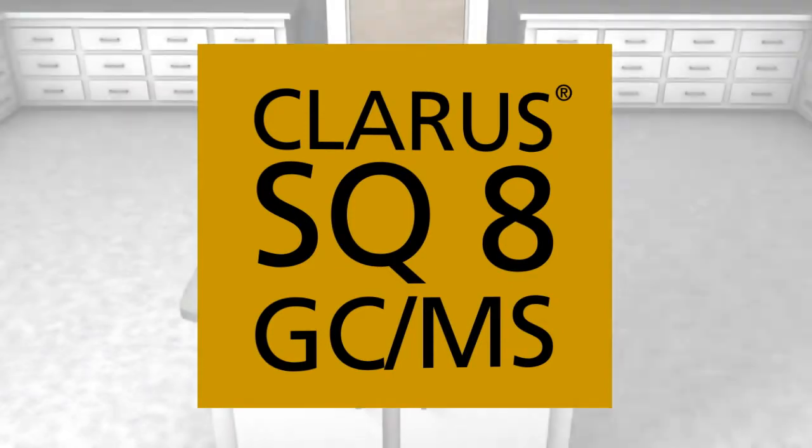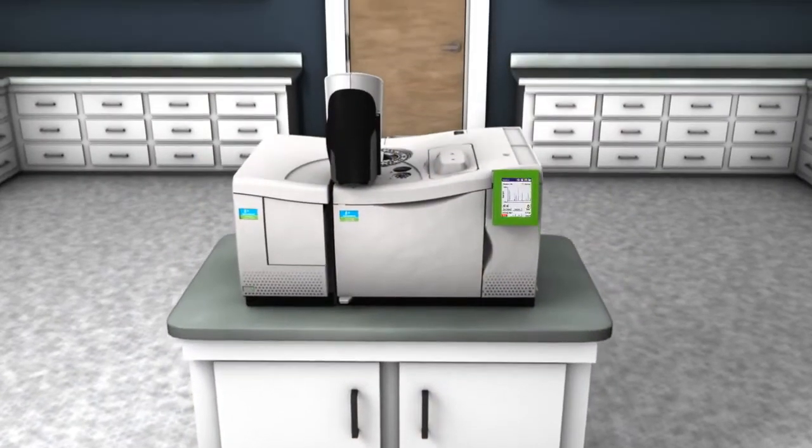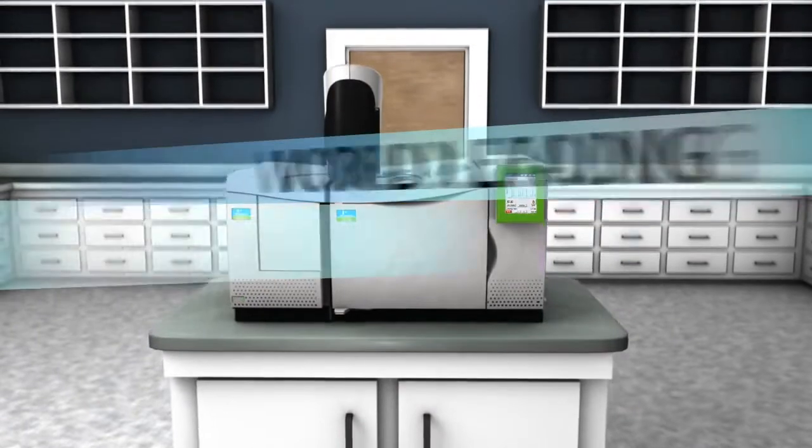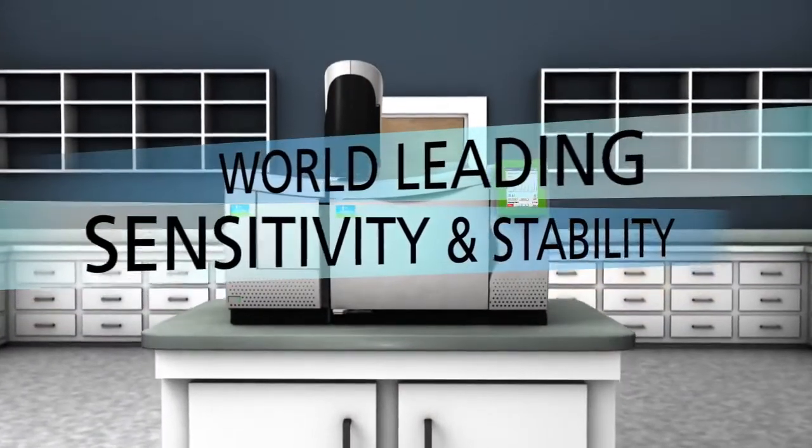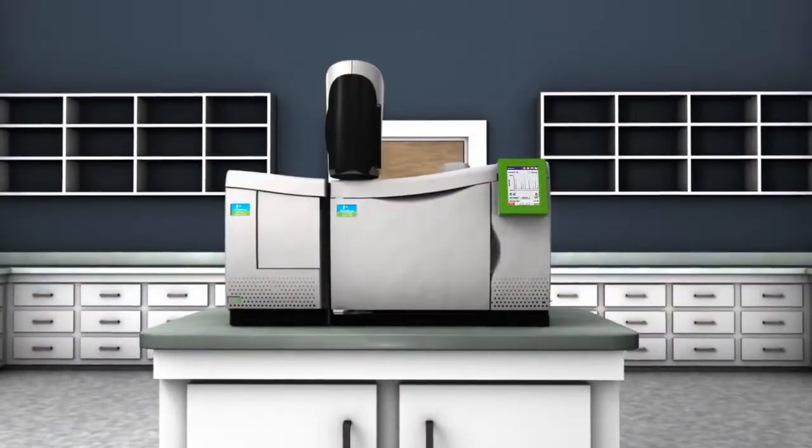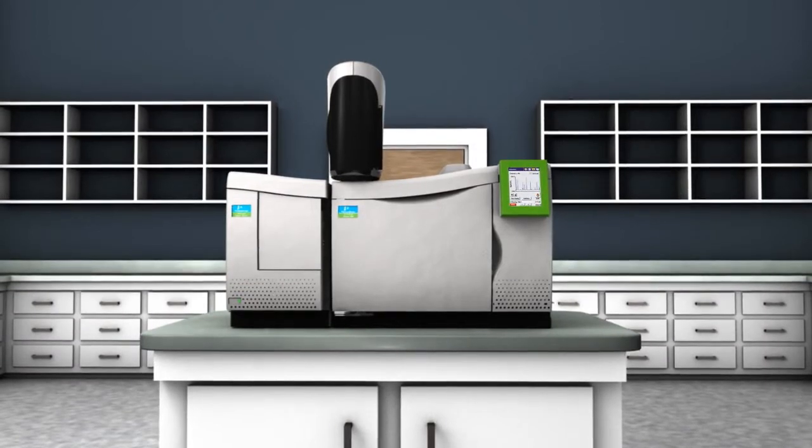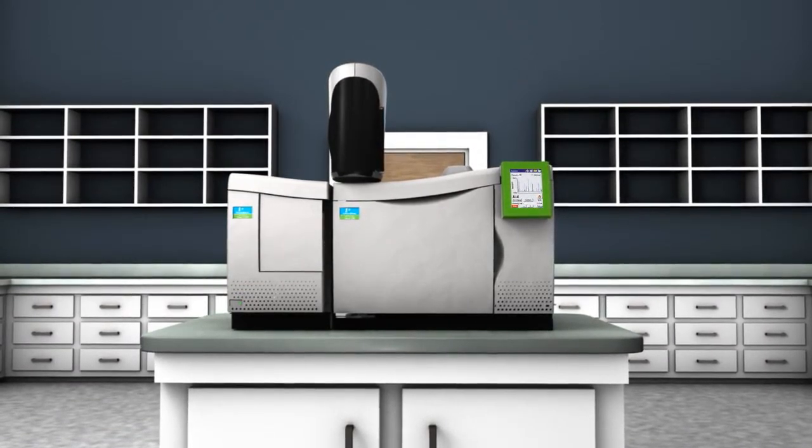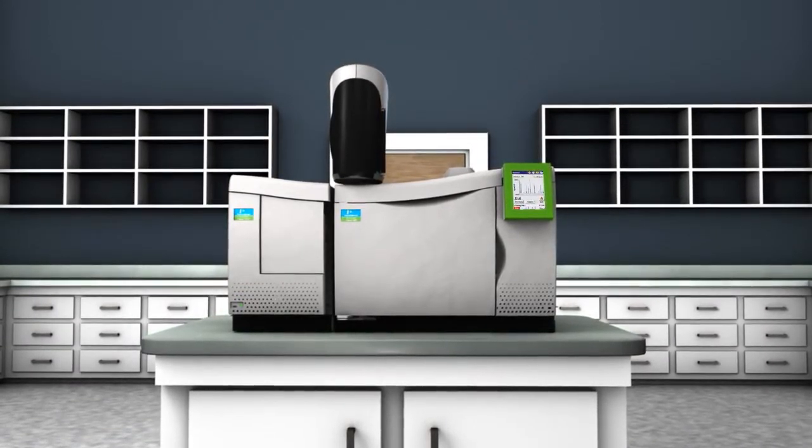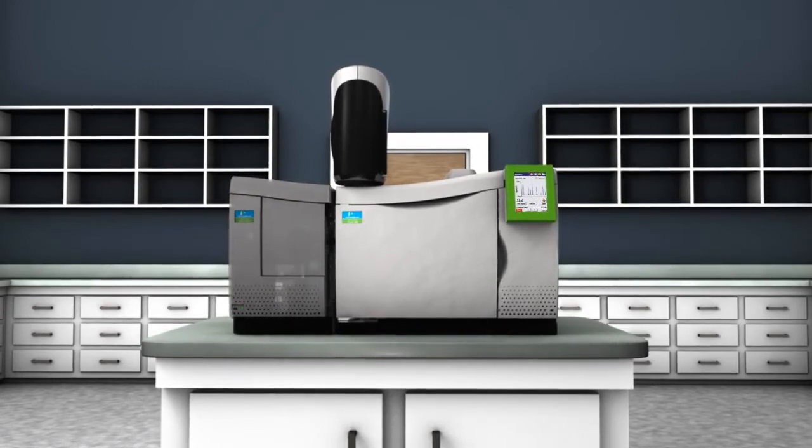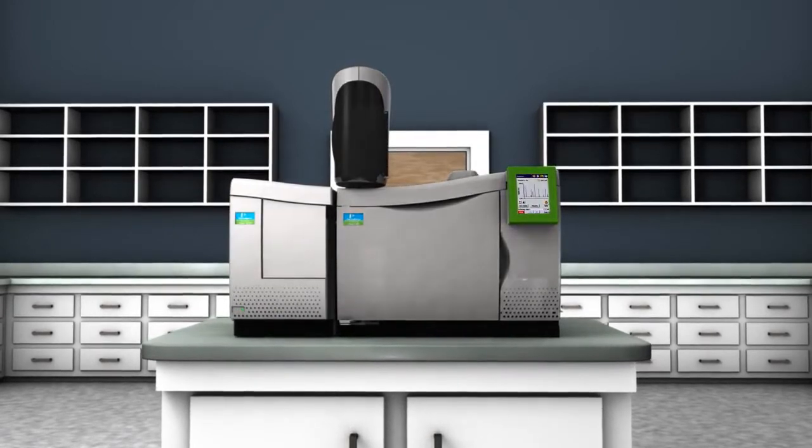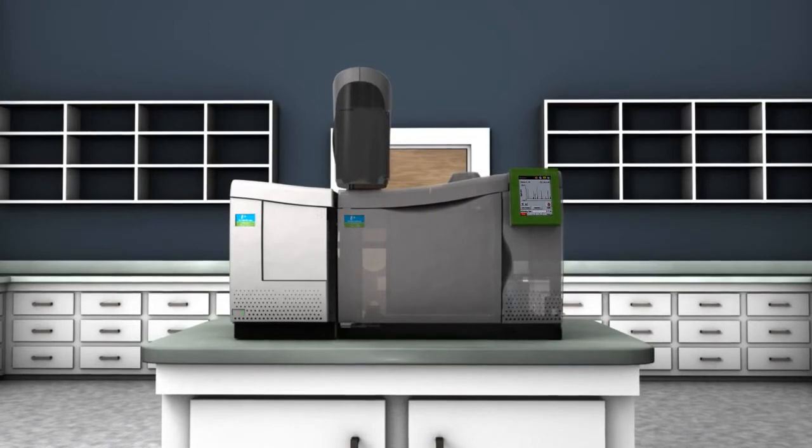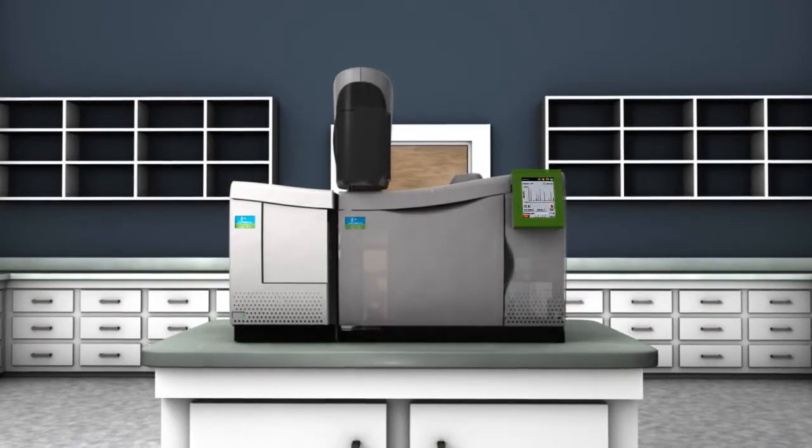The Clarus SQ 8 Gas Chromatograph Mass Spectrometer brings world-leading sensitivity and stability to GC-MS. Engineered to deliver the best, most consistent ultra-trace detection limits, the Clarus SQ 8 GC-MS features exceptional front-end GC capabilities perfectly integrated with a cutting-edge single quadrupole MS detector.